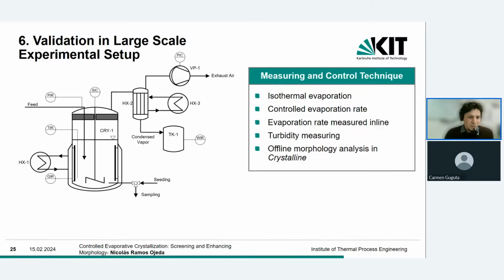Turbidity measurement was also present, and a second difference is that we don't have inline assessment of the crystal morphology. So we need to sample the suspension from the crystallizer, and in order to have the same analysis, those samples were placed in Crystalline to assess the crystal morphology.